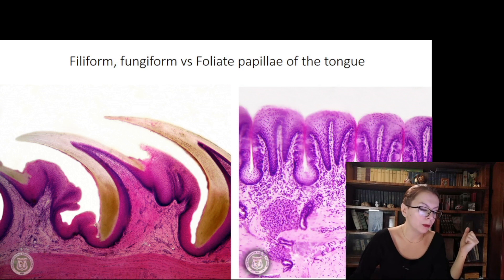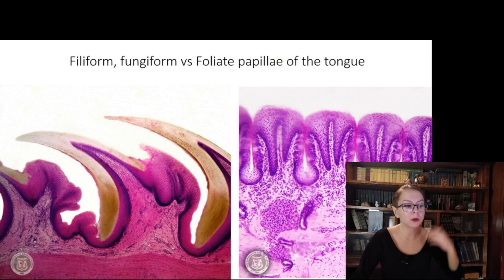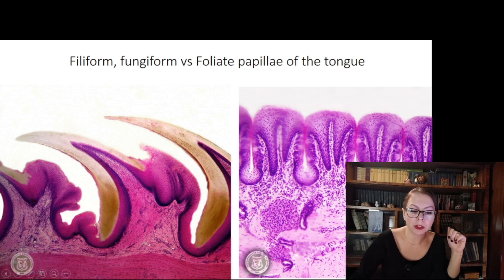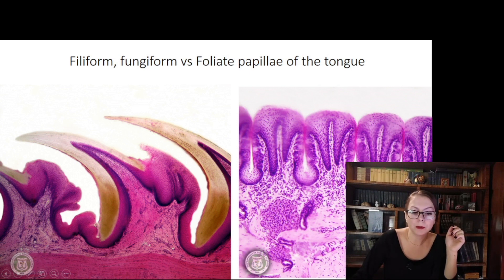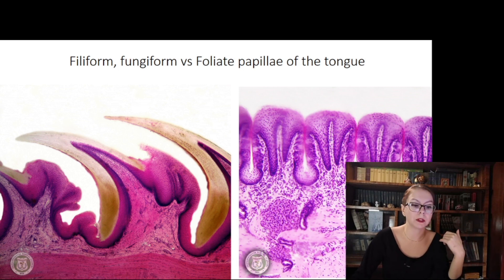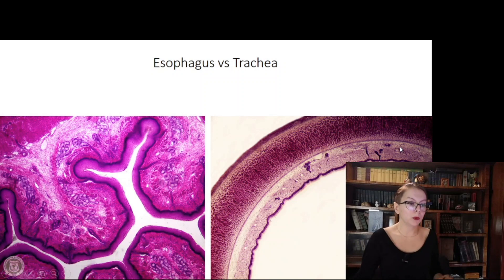Notice also in the specimen that the lamina propria is in direct contact with the skeletal muscles of the tongue — submucosa is absent on the dorsal surface. On the lower ventral surface of the tongue, submucosa is present. Also pay attention to small salivary glands draining into the grooves around the papillae; these salivary glands help remove old taste particles and allow new tastes to come into contact with the taste buds.